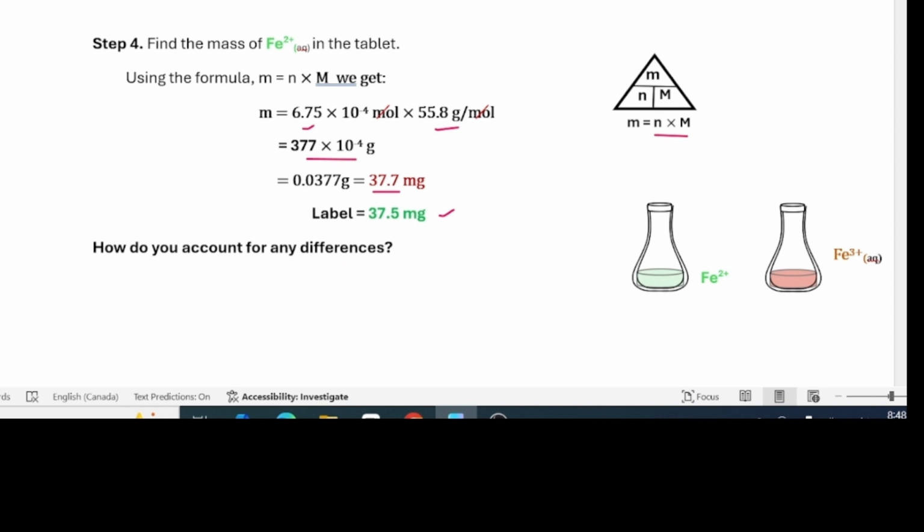One of the problems with this titration is that when the permanganate is added, it changes ferrous ions into ferric ions, which impart a slight brownish color to the solution. So it is difficult to see the endpoint clearly. In most cases, it entails using a few extra drops of permanganate.